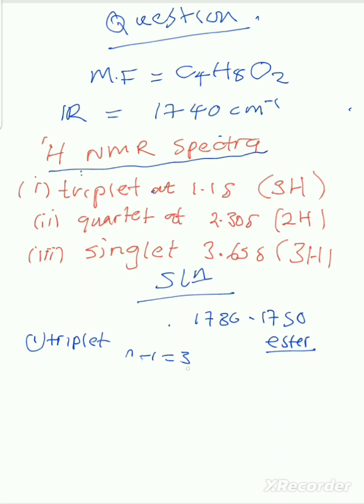Now, we also need to know about this, which is 1.1 ppm. So this chemical shift, what can we tell about this thing? We said from 0.2 to 2.5 it is CH, which can be CH3, CH2, or CH. But looking at that, we have been given that the number of hydrogen is 3 here. So here you know that 1.1, which is in between 0.2 and 2.5, is CH, which can be CH2, CH3, or CH, but here it is 3H, which is CH3, you get?